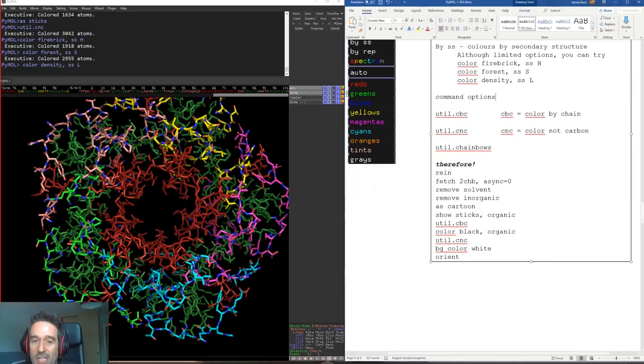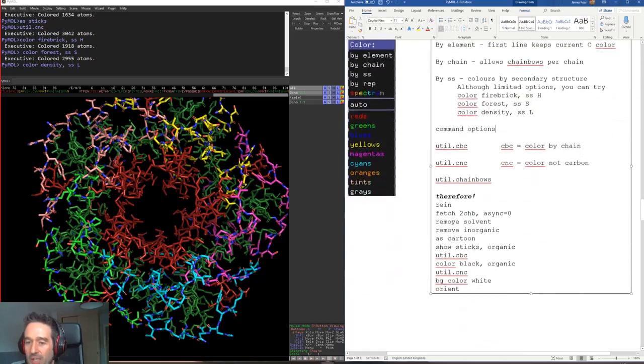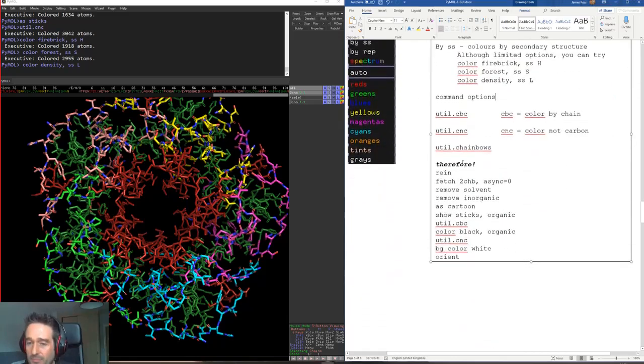Now, so we've gone through these guys here and the selections down here, and I've talked a little bit about how we can type in various different commands. So I just thought I'd like to show you how typing in these commands can make your life easy.